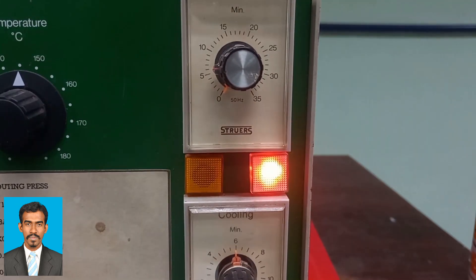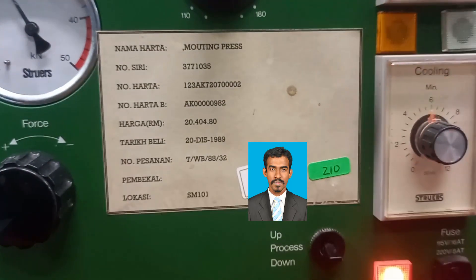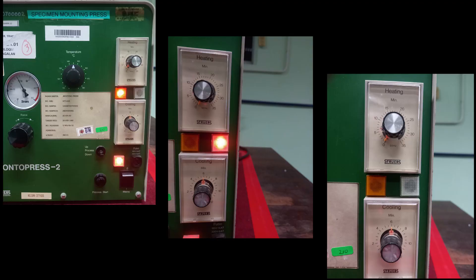During heating, the LED on the heating knob will blink. Similarly, during cooling, the LED on the cooling side will light up. Once the process ends, both LEDs will switch off. This can be clearly seen in these photos: if it is the heating process, the heating LED lights up; if it is the cooling process, the cooling LED lights up; and once the process is stopped, both LEDs are switched off.